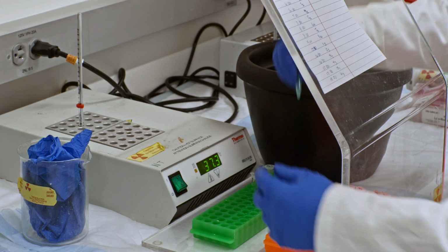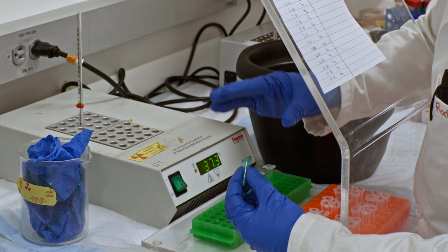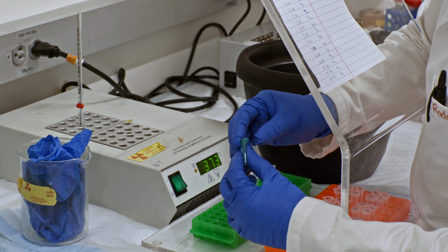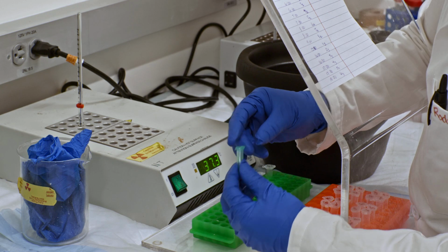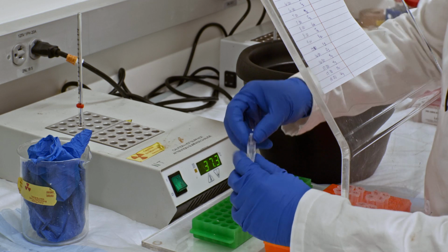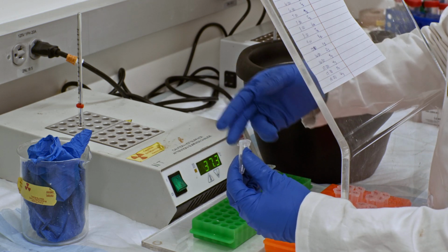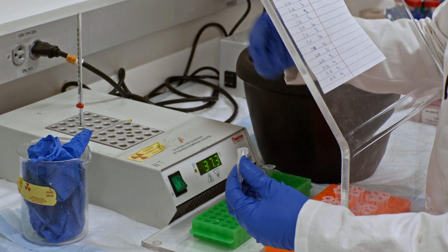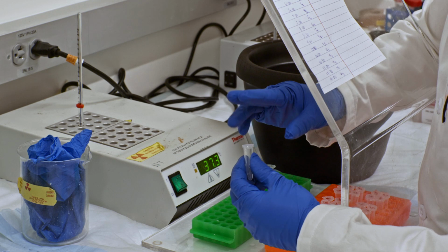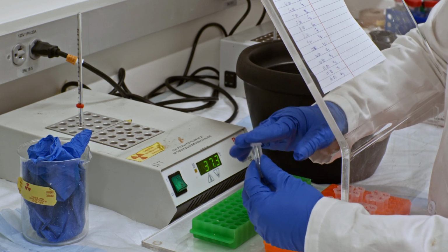I like to keep everything on ice until I have to add my radioactive DNA. So here is a portion of the enzyme that we're going to use in today's experiment, which is called ETA. And then I also have a master mix of all 4 different dNTPs, such as dATP, dGTP, dCTP, and dTTP. So a master mix of all those dNTPs at a concentration of 50 micromolar each, which is what you'll use to initiate the reactions. Here in this ice bucket, we have 8 different samples.